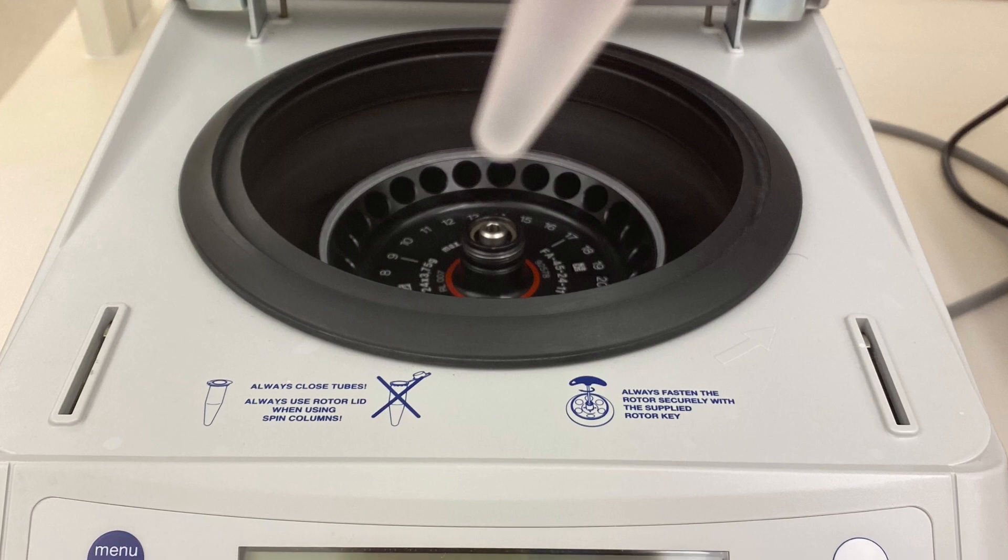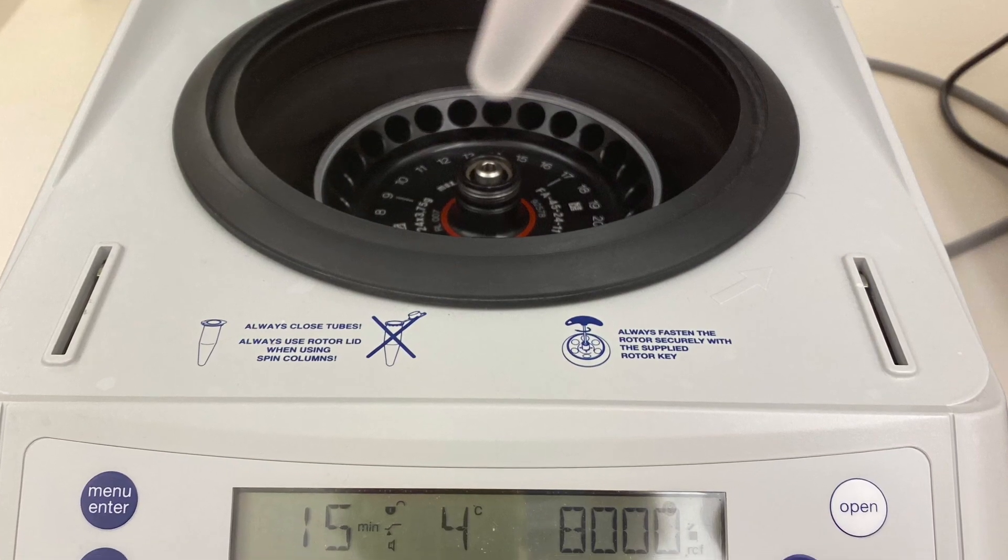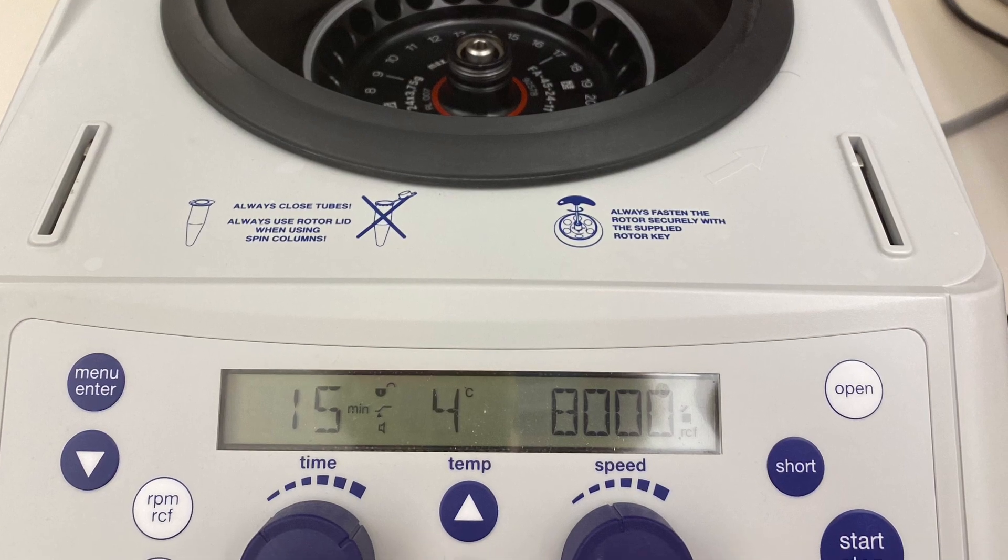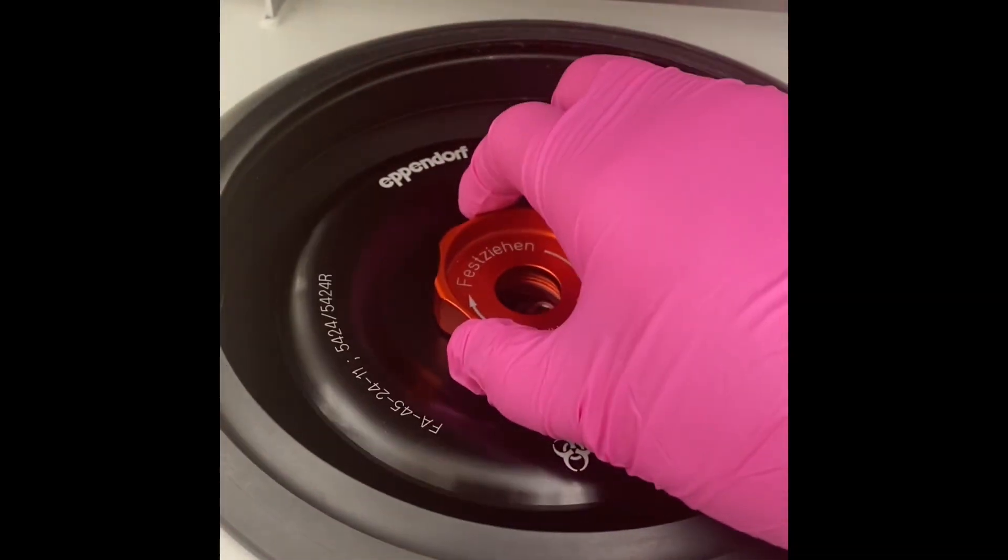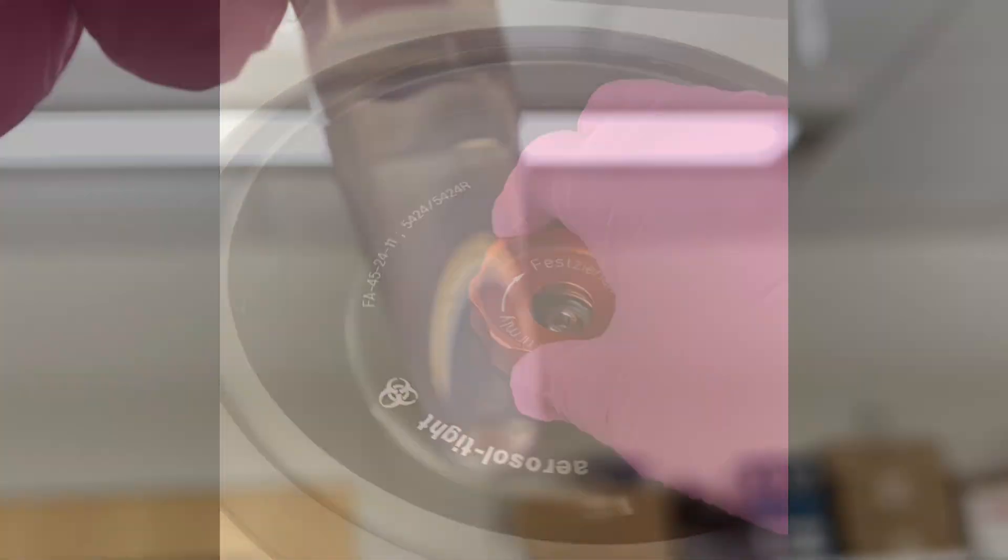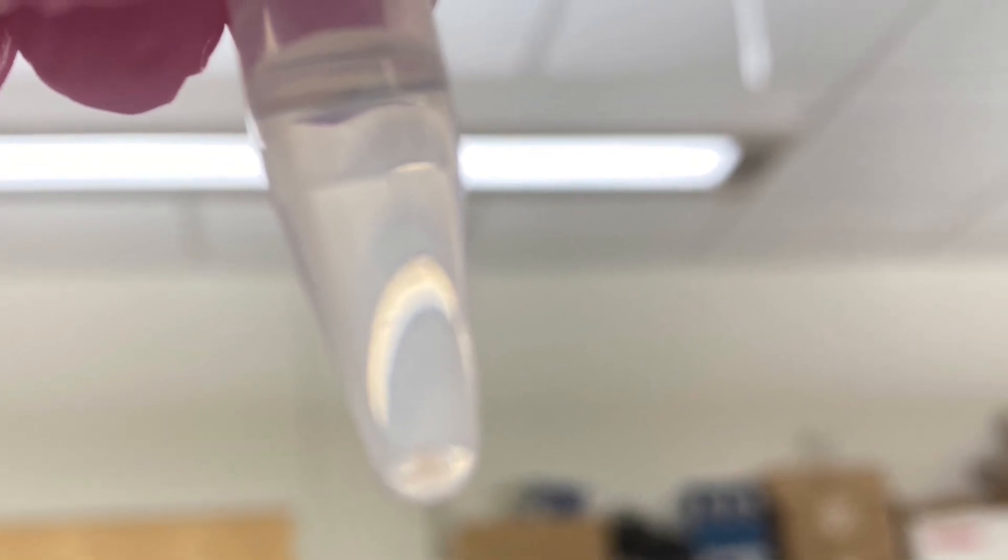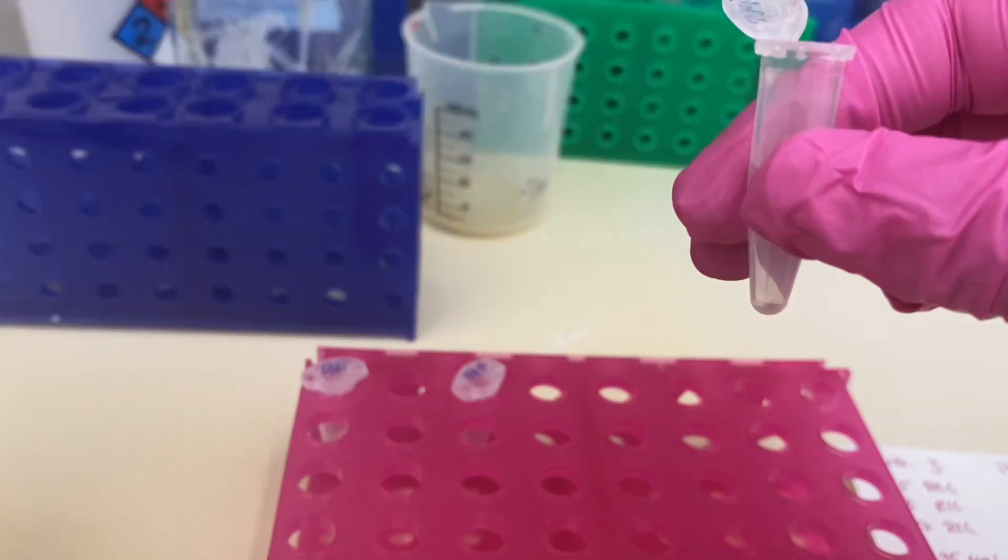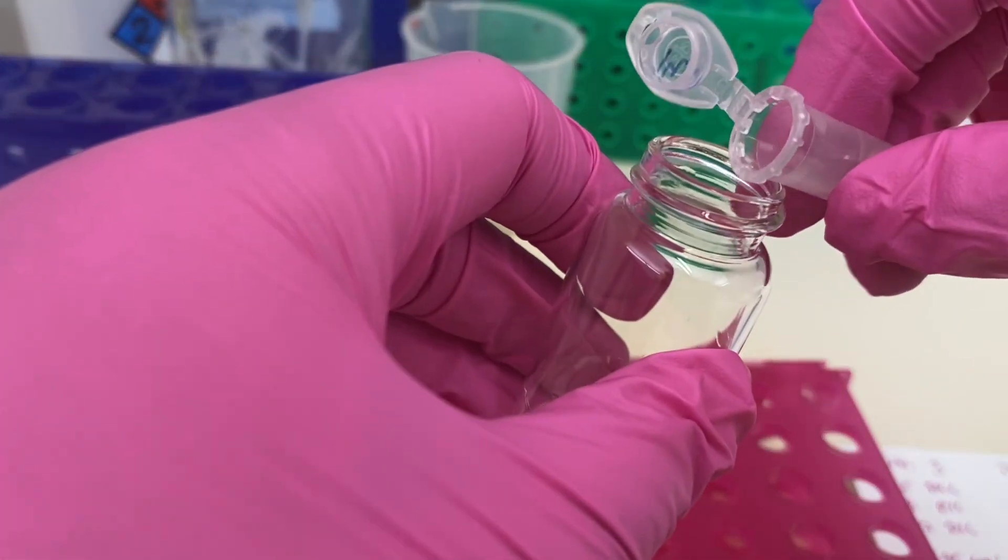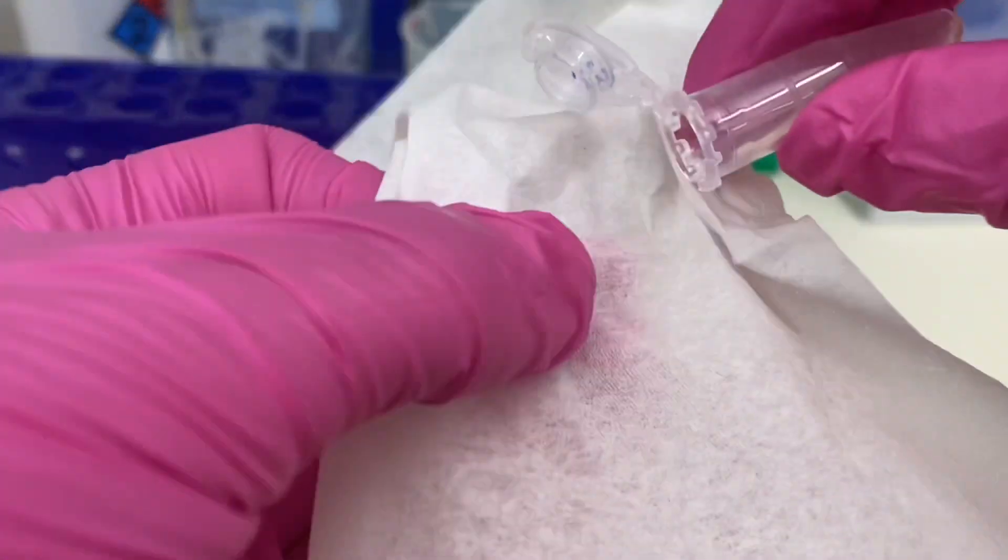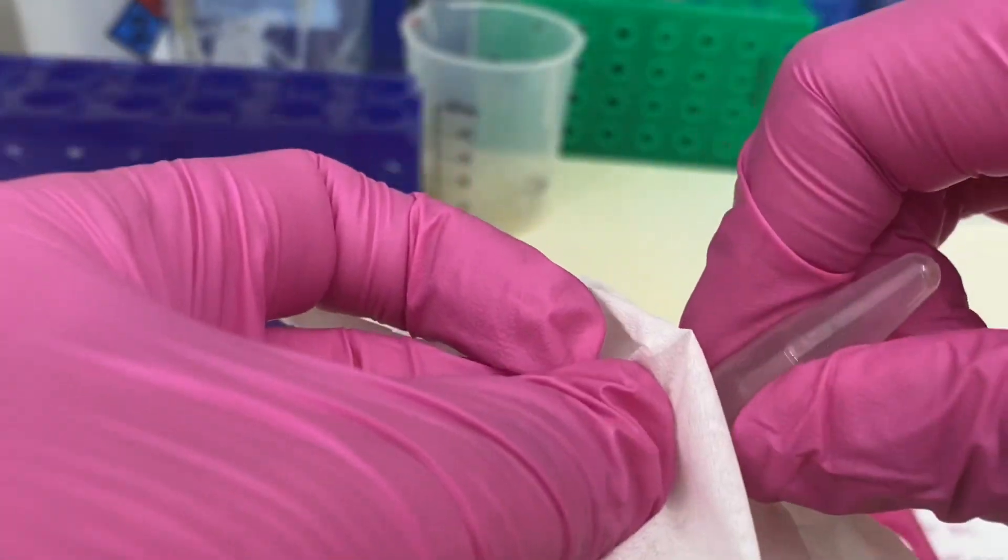The next day, I will have to centrifuge my samples at 8000 g for 10 to 15 minutes. That way I'm expecting my proteins to be in a pellet. As you can see here, it forms like a nice white pellet at the bottom. And after that, I will decant the acetone out really carefully not to disturb the bottom where the pellet is.